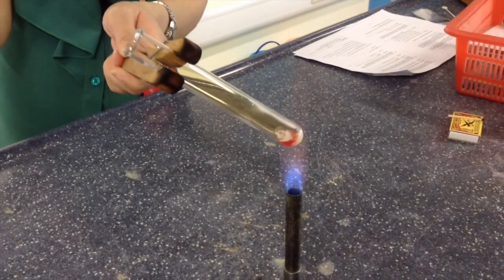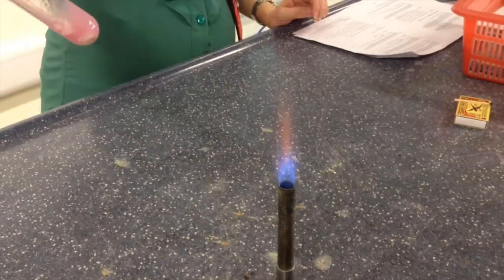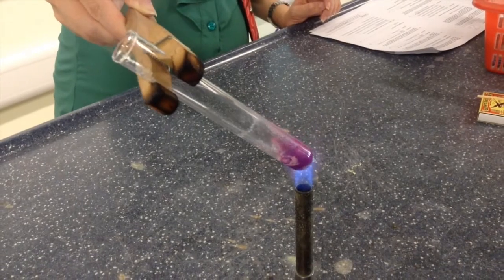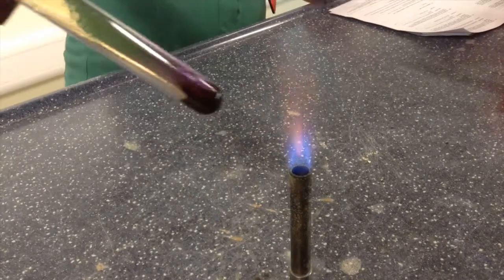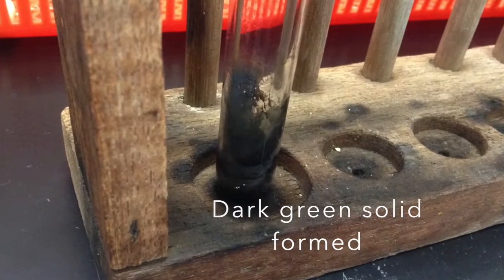Heat the test tube gently at first to remove water, then heat strongly until you see a colour change. Allow the contents of the test tube to cool.